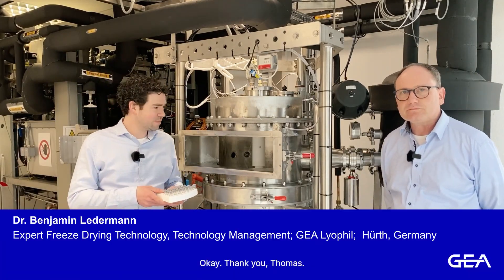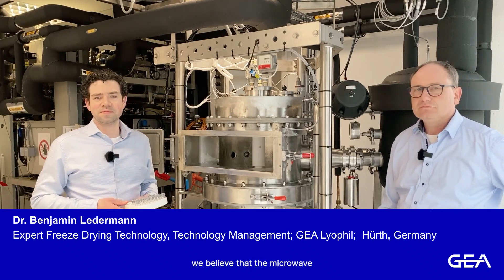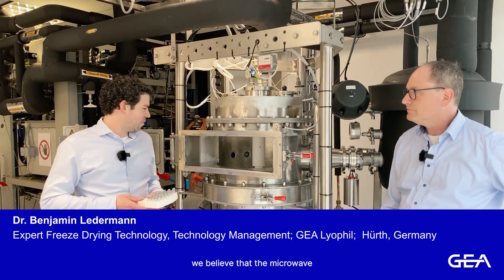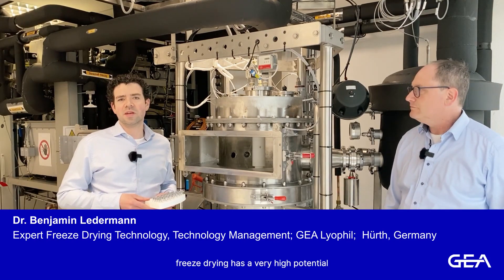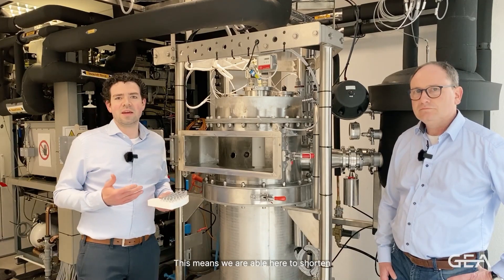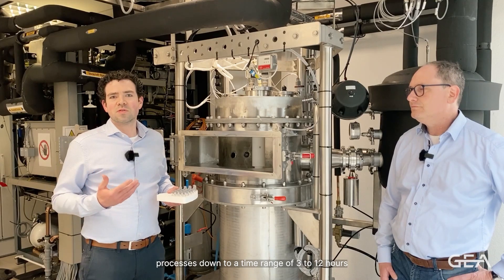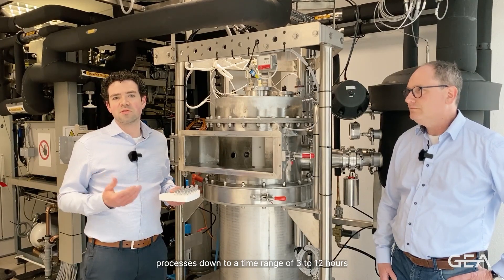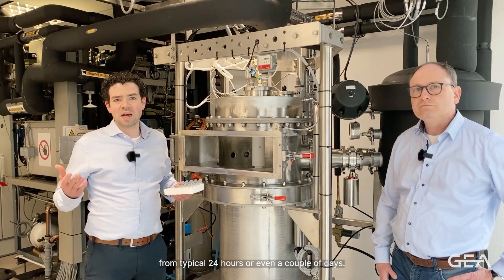Okay, thank you Thomas. Here at GEA we believe that microwave freeze drying has a very high potential to drastically reduce the process times we typically see in our freeze drying processes. This means we are able to shorten processes down to a time range of three to twelve hours, from typical 24 hours or even a couple of days.